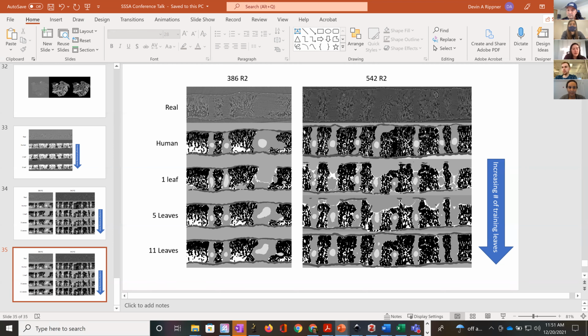So how do we access the folder, and how would we go about starting a project? Sure, I will share that folder with you. I'll just make you the owner of it, and then it should work fine. We're in the process of publishing this right now, and in the future, you'll just be able to go to my GitHub and do it from there. Okay.